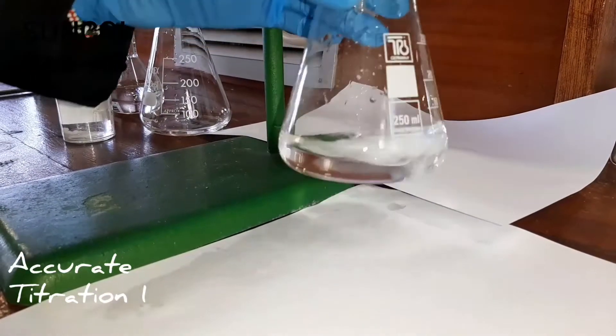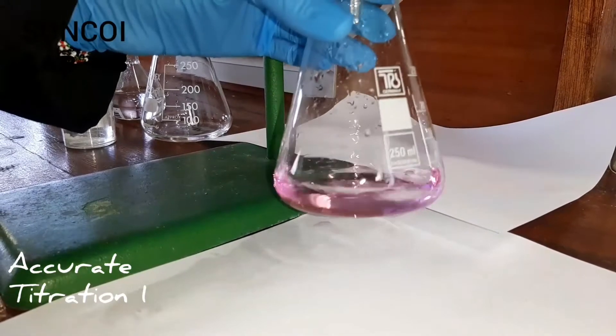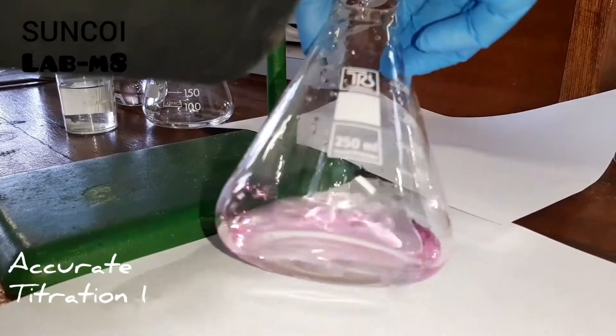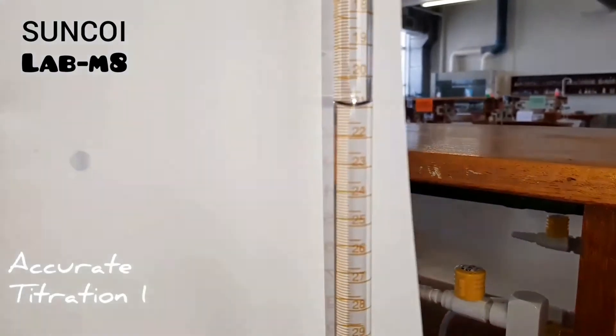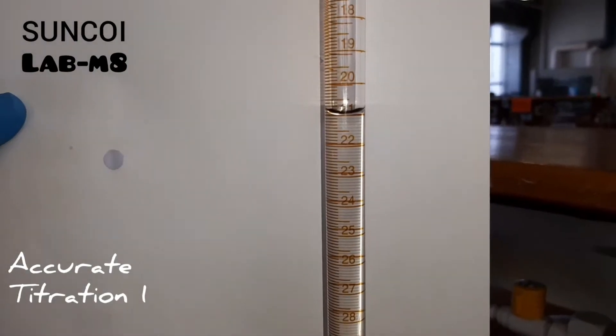It really is a matter of one drop and you'll see the end point — and there we've reached it, very quickly. If you keep mixing and the color doesn't go away, then you know that's your end point. Press pause and try to take the reading.